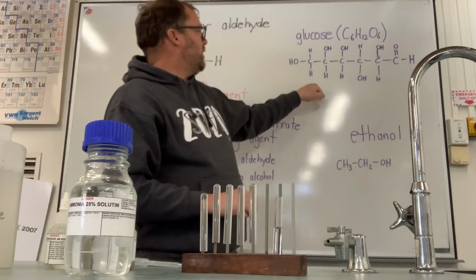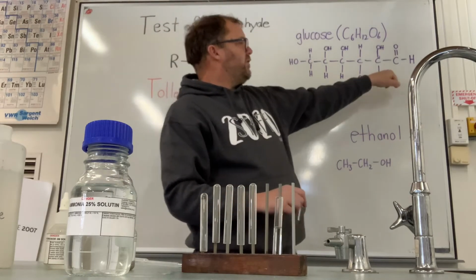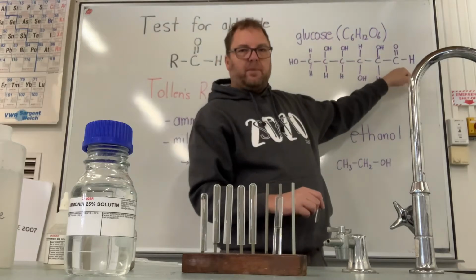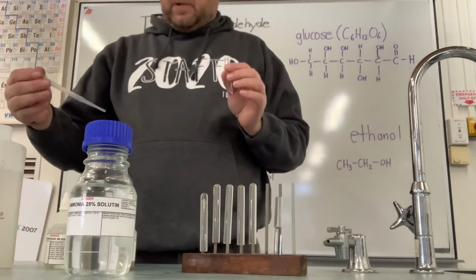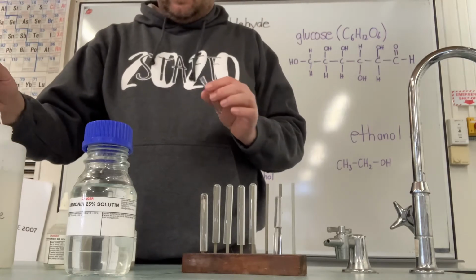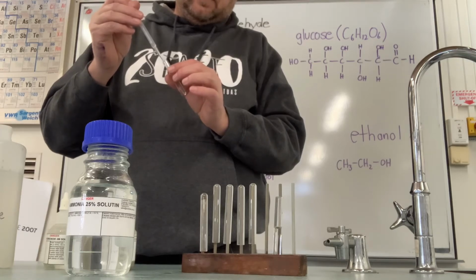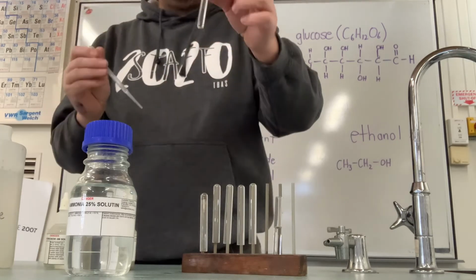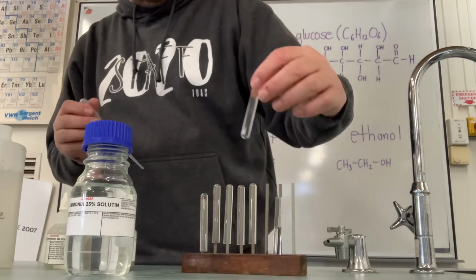Here is, at least in the linear form, the structure of glucose, and we've got this aldehyde group up here on the end that we're testing for. So if we add some glucose to this one, so I've just added some glucose solution to that test tube, and then we'll just put this aside.